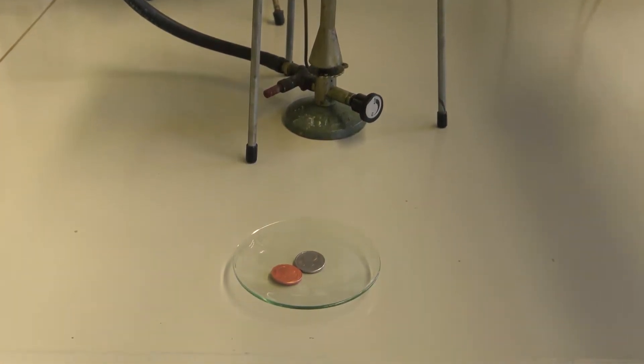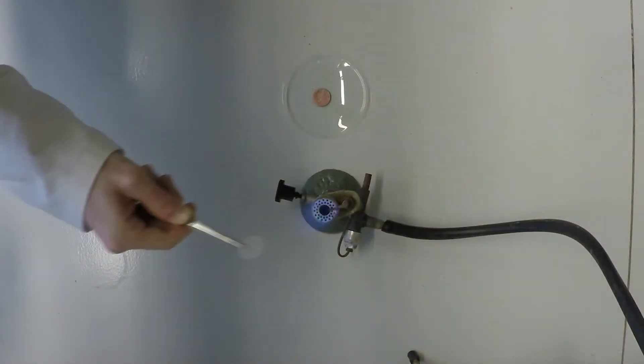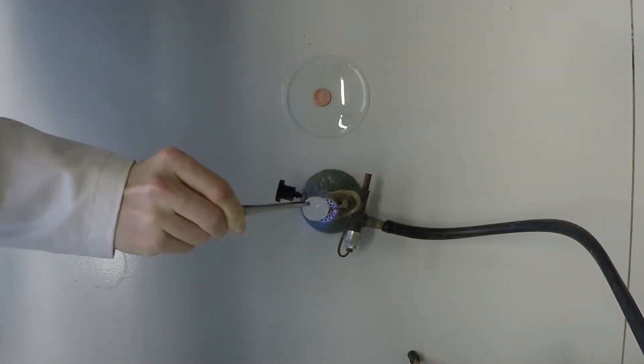The result is a silver coin. Heat the silvery coin in the flame of the Bunsen burner. The color changes from silver to gold.